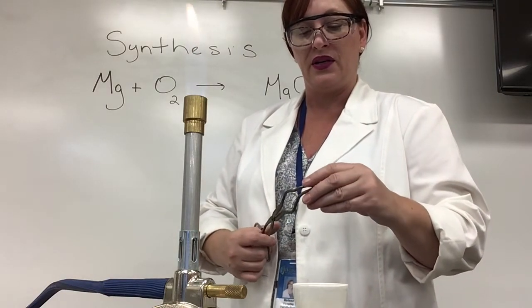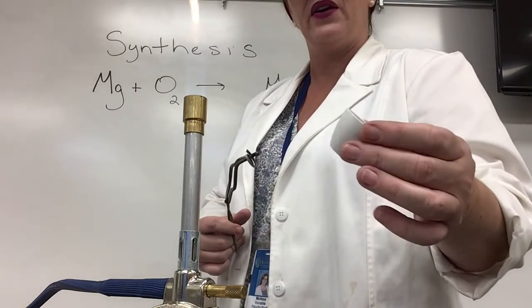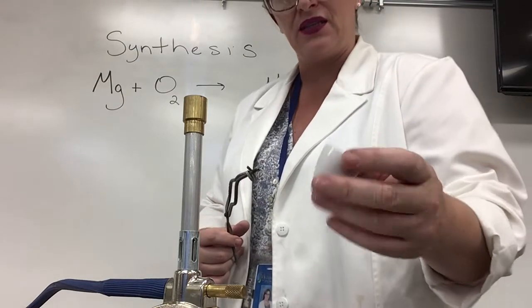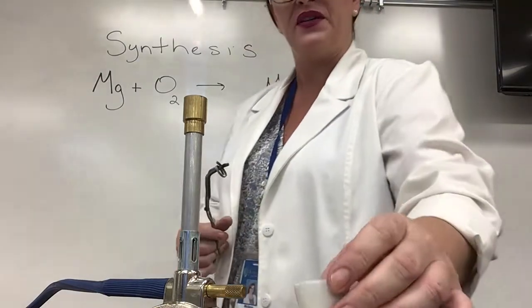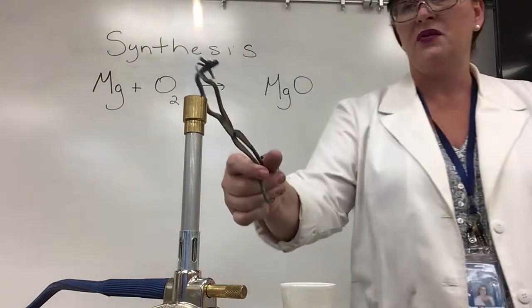So I'm gonna try to look away and I also have a little crucible here. This thing's gonna be very hot and so I don't want to put it on the lab desk. This is porcelain that's meant to hold really hot material. So this is what I'm gonna drop it into after it flashes. Alright so here we go.